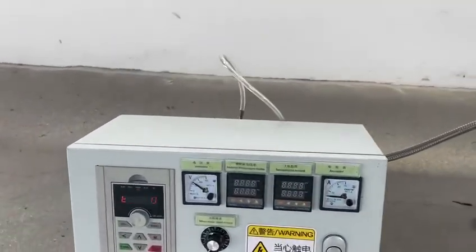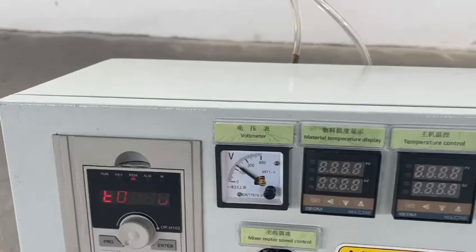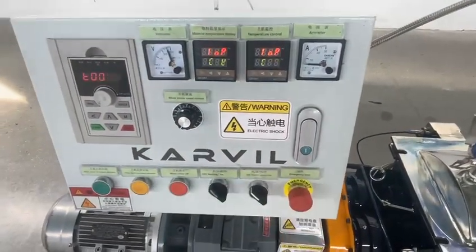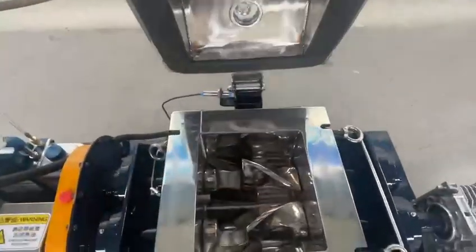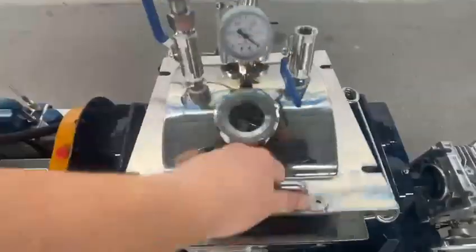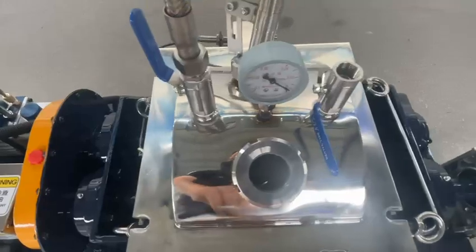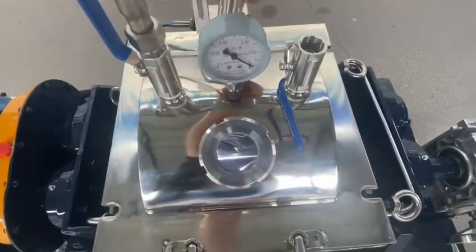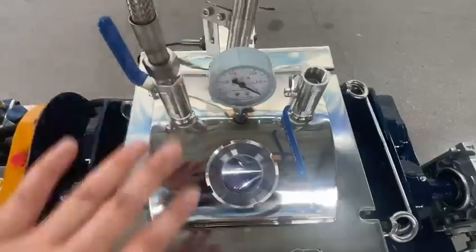Now the mixer has been connected with the electricity source and we release the emergency stop. We can see this is the mixing chamber, and we can check the mixing situation via the light on the window behind.